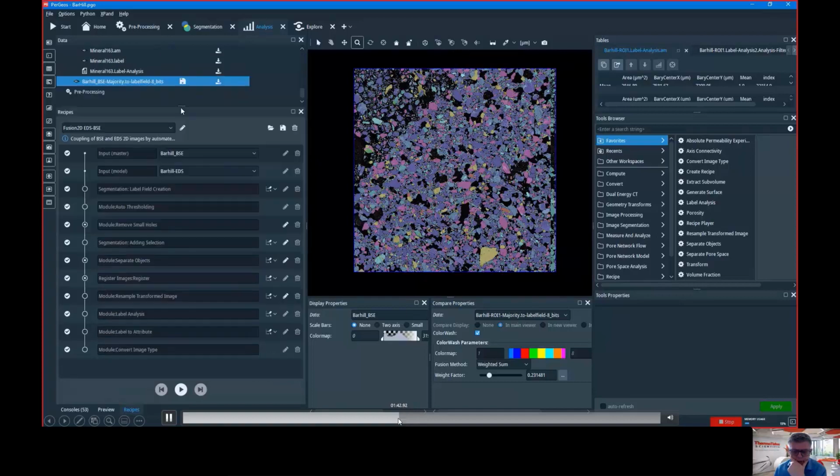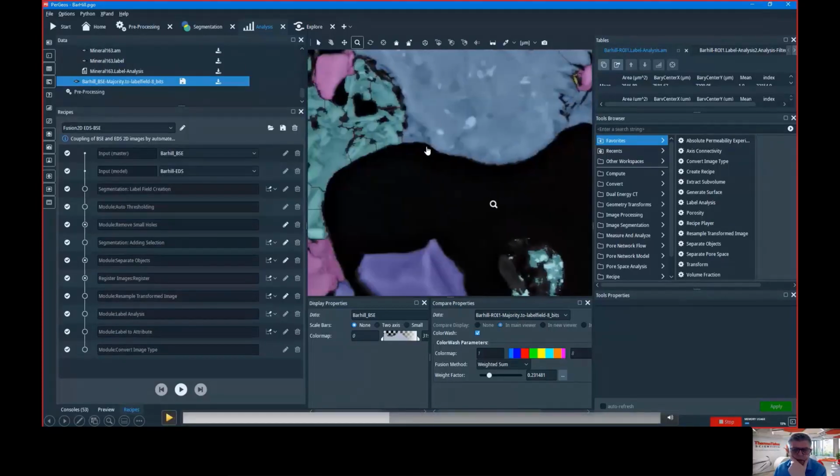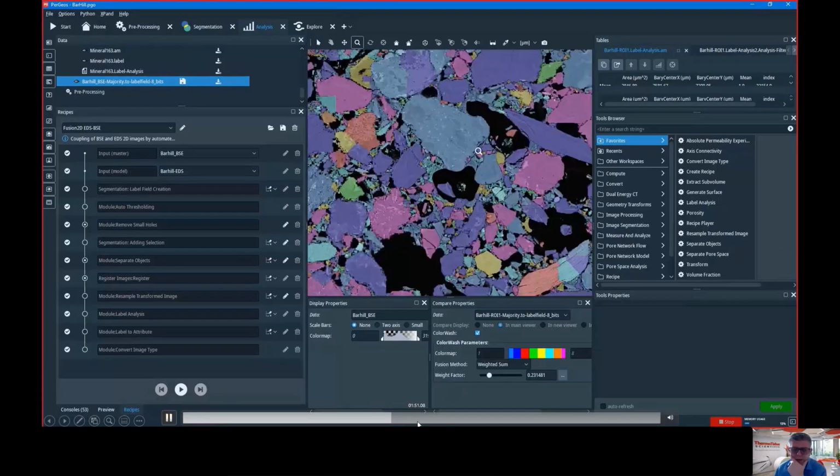Actually, that's another thing. Maybe I didn't tell you. It's clear here. You see the EDS now. It's at the same resolution as the BSE. So the two acquisitions are upscaled to the same resolution. Because we have chosen to select the most relevant mineral in the grain, we can do this upscale. It's a choice. For this specific workflow, it's a good choice.